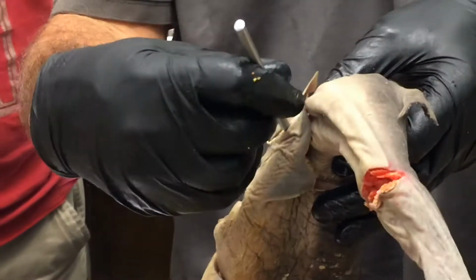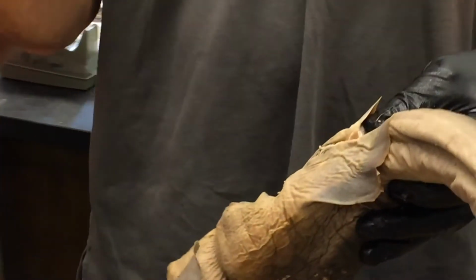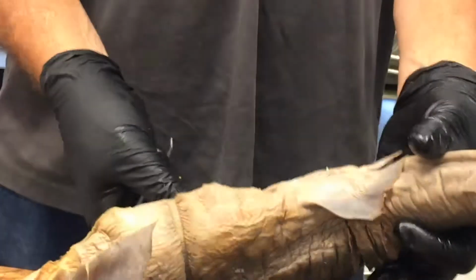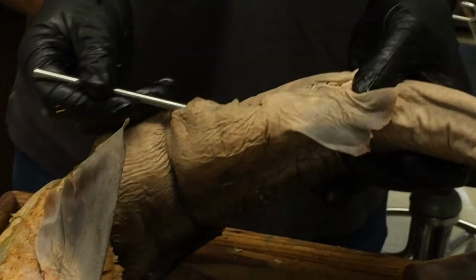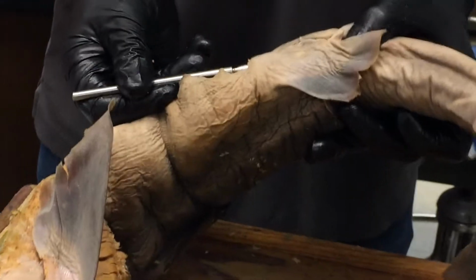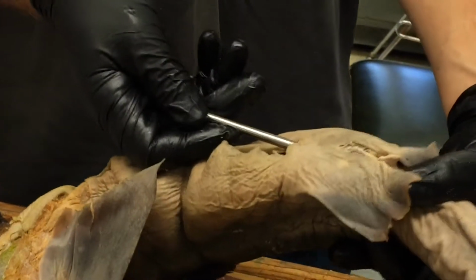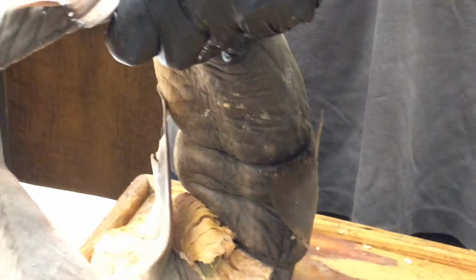Okay. So this is urodeum, coprodeum. Those are just two different regions. Doesn't the uterus go towards the urodeum? The uterus does dump out into the urodeum. Okay. And it's on either side of the urinary papilla. So this is the probe that's coming down the uterus, and it pops out through that pore or opening on the side of the urinary papilla.